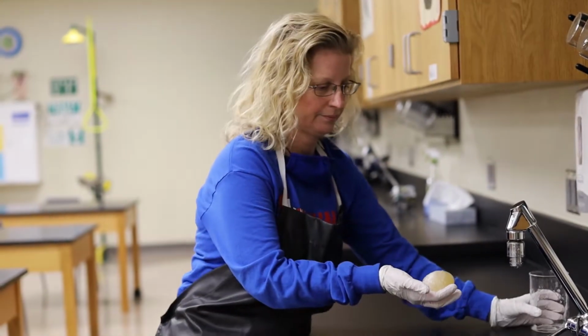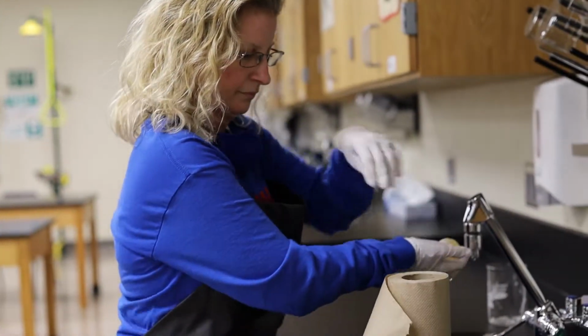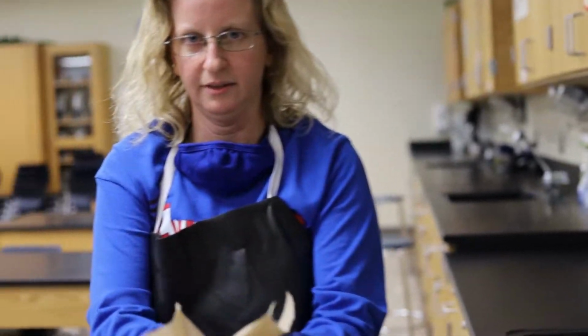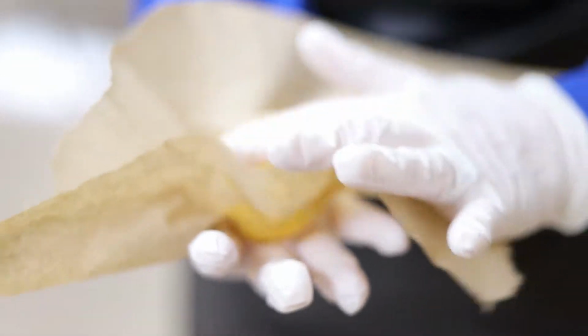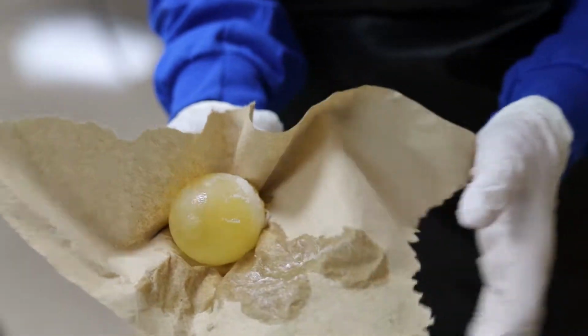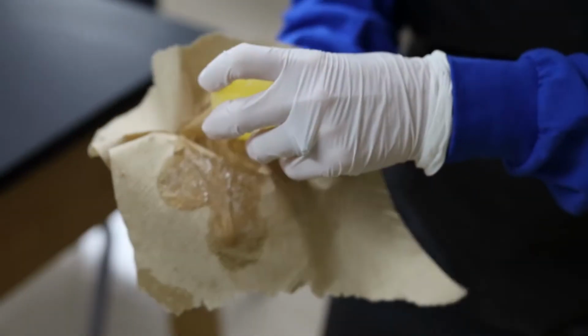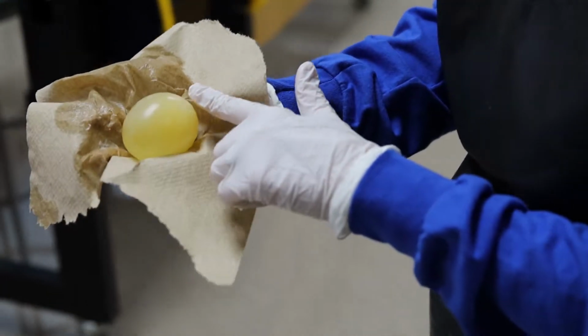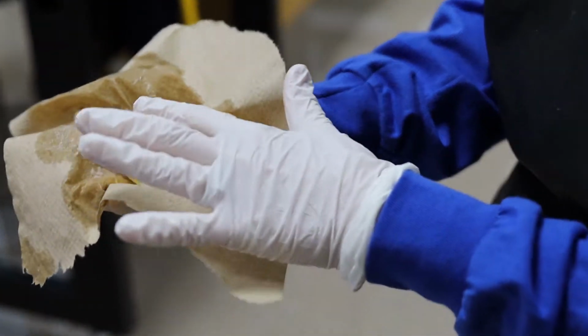There's the egg. Now, what happened to the eggshell? It is mostly gone. Because remember that chemical reaction that was happening? The calcium carbonate of the eggshell was reacting with the acid in the vinegar.